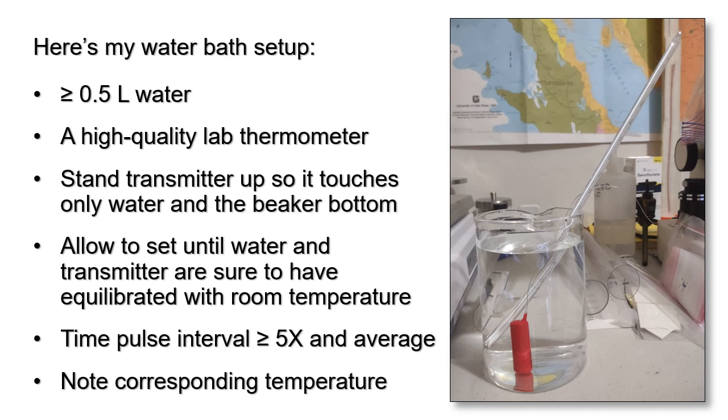Here's what my water bath setup looks like. I use a beaker, either a half liter or full liter beaker, and fill it full of tap water. I put a high quality lab thermometer in the water and I stand the transmitter up on its end so it only touches water and the bottom of the beaker.